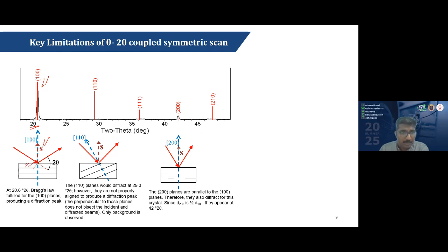and the surface and the planes are parallel to the sample. Here there are 110 and 111 peaks also, which may satisfy the Bragg equation at an angle of about 29 or about 36 degrees, but they may not be visible even if they are present, since these 110 and 111 planes may be tilted to the sample surface.